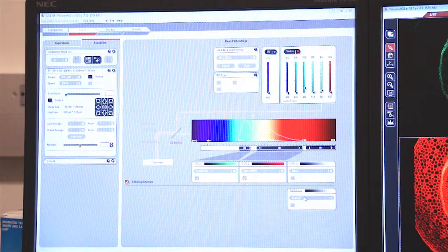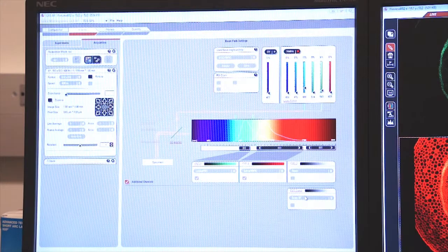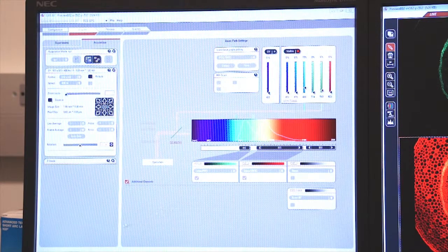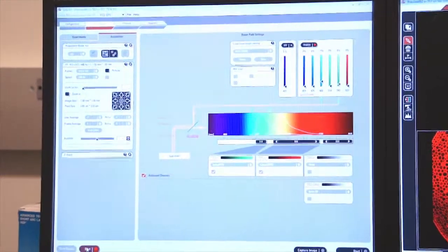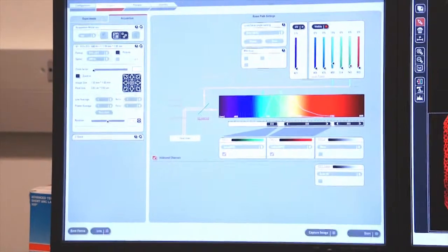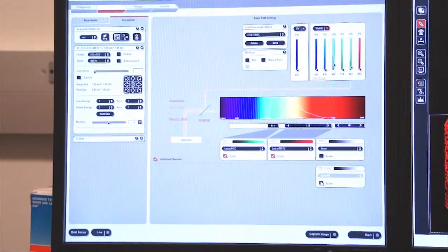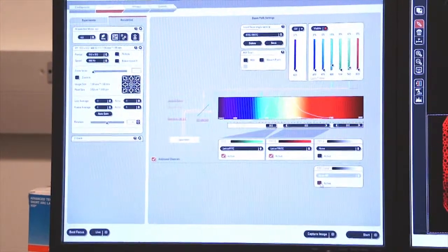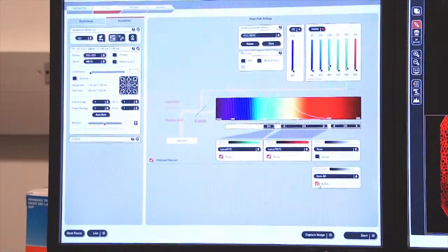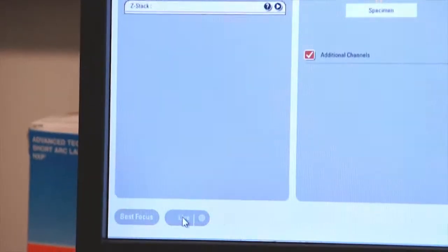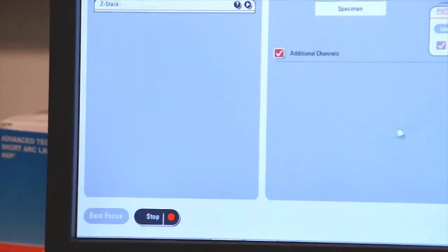I also have another photomultiplier tube that can be used for transmitted light. So I'm going to press stop, stop the live imaging and now I'm going to select the photomultiplier tube for a bright field image. Again, I go back to live.